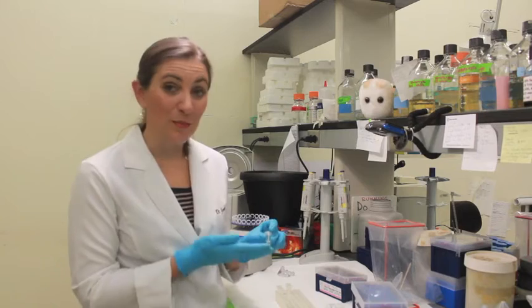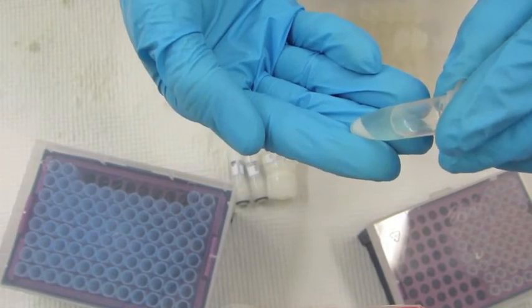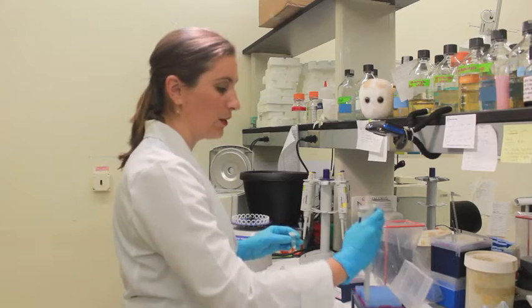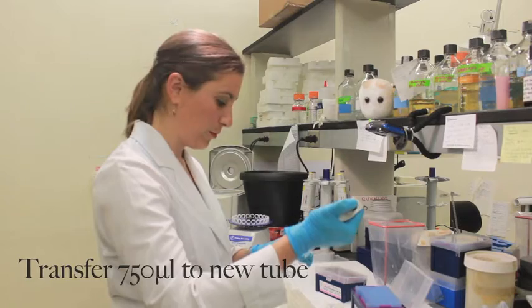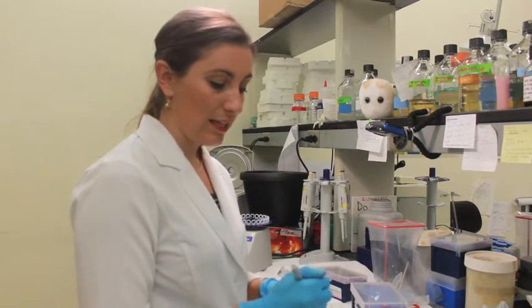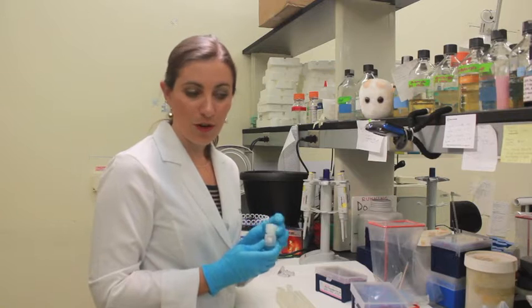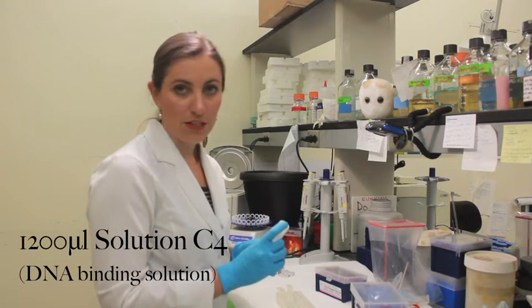At this step, you should be able to see that white pellet — it's really viscous, and we want to avoid touching the pellet for this next step. You are going to transfer 750 microliters of the supernate, the liquid above the pellet, into a new tube. We are now at the step where we add C4, or step 14 in the experience user protocol. Solution C4 is in the large bottle, and you are going to add 1200 microliters of this into that tube.